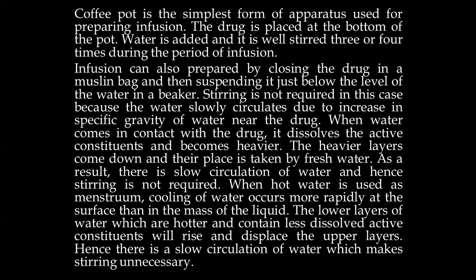During exosmosis and endosmosis, the menstruum enters into the drug, and the menstruum becomes a solution. That solution is coming out. When you compare solvent and solution, the solution density is more. So automatically the solution goes down and the fresh menstruum comes up. So we just suspend the muslin bag just below the level of water, not completely immersed into the bottom of the pot. What will happen? The solution goes down, and the fresh menstruum comes up, so that the extraction is efficient even without stirring.